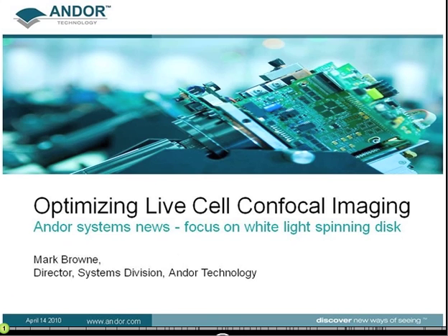Hello, this is Julian Heath, the editor of Microscopy and Analysis, and I'm here as the moderator for this webinar in which Dr. Mark Browne of Andor Technology will give a presentation on how to achieve optimal live cell imaging by focusing on the principles of operation behind the new white light and differential spinning disc techniques using Andor's confocal microscopy system, the Revolution DSD.